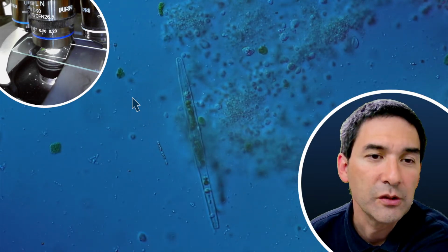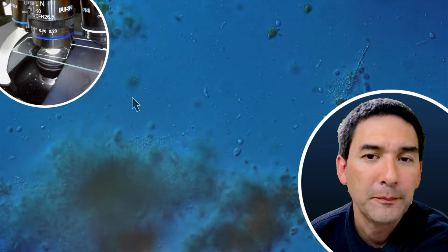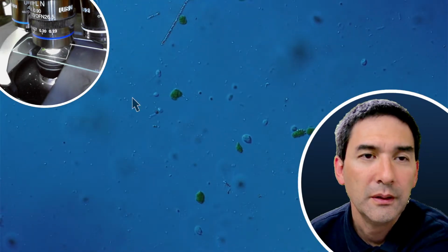This long thing here is a diatom again. Yep. Yeah, okay.